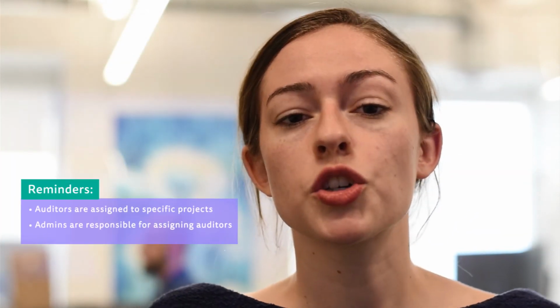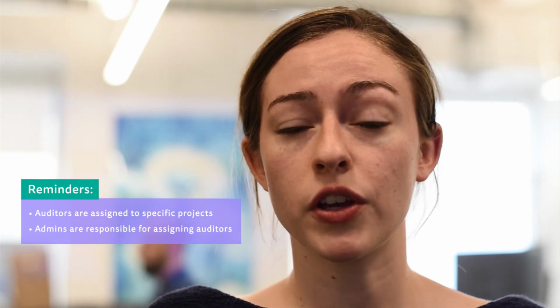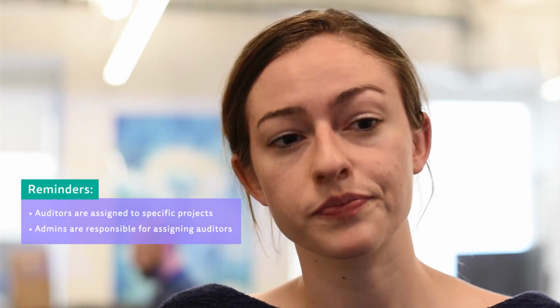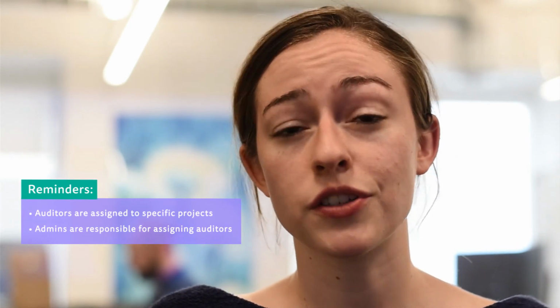As a reminder, your company's Benchling admins should watch our Projects and Permissions overview and our admin training to learn how to add auditors to projects. Note that your company does not have to use Witness and Review. If your company does not intend to develop drugs or is small enough that you prefer not to use Witness and Review, admins can choose not to add auditors to a project.